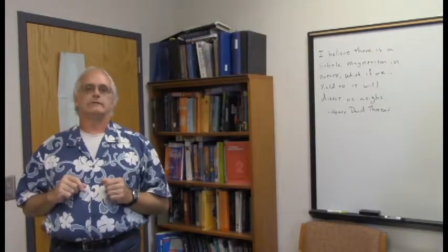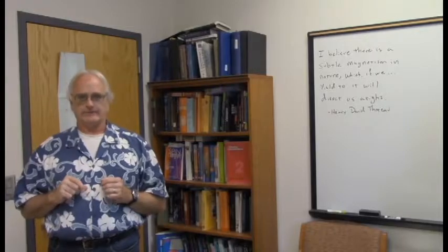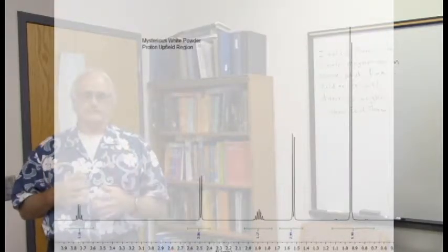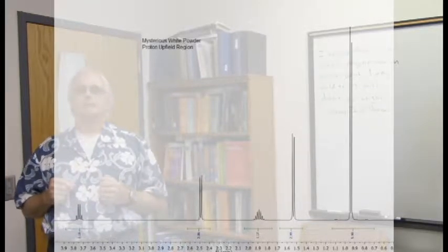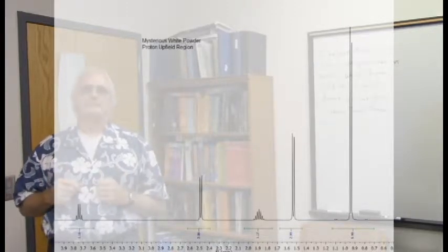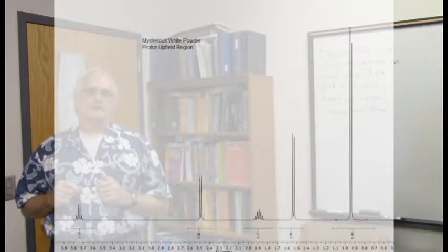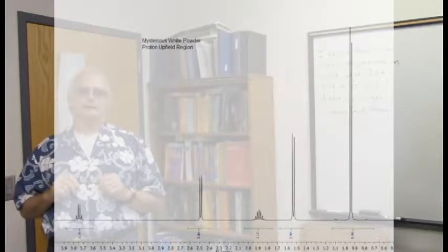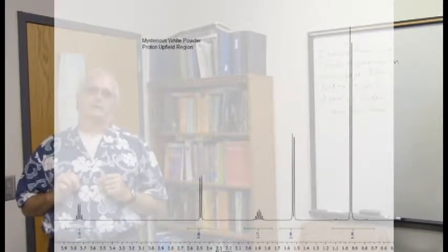And now our attention focuses on the upfield side, on the aliphatic region. None of these peaks have chemical shifts consistent with alkenes. They all seem to be coming from things that are just singly bonded, classic aliphatic peaks out here, with some lovely coupling patterns. And in fact, to be honest with you, a really careful analysis of the coupling patterns would probably be sufficient to put this structure together.